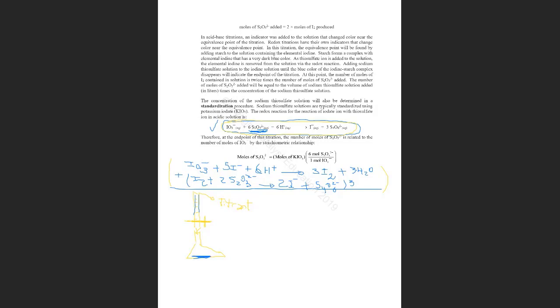So here is the bleach, the one whose concentration we don't know and need to find out. And then we use the stoichiometry of the reaction between the two solutions to calculate the concentration of the analyte, which is our unknown solution.